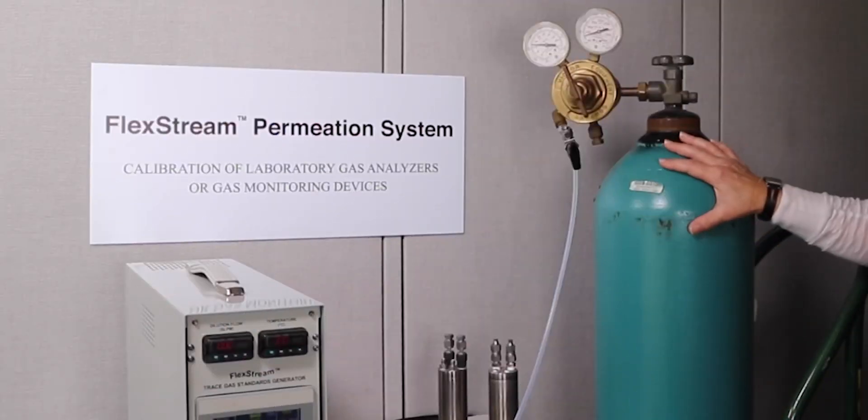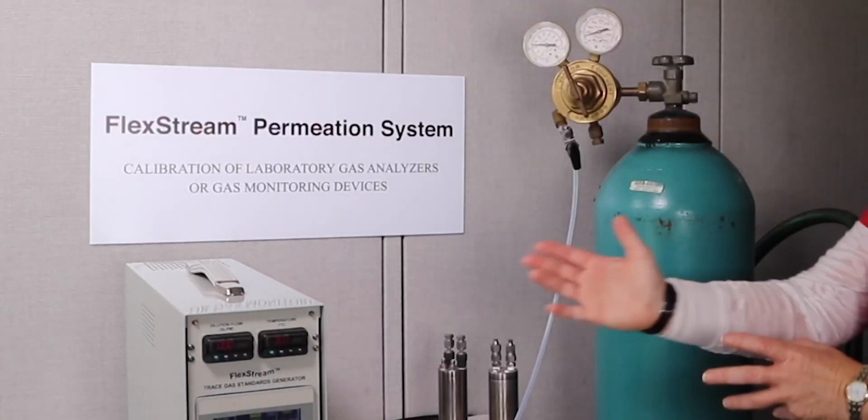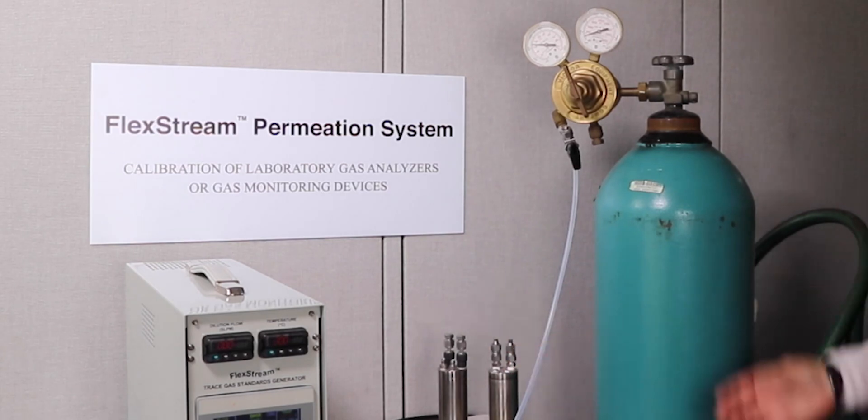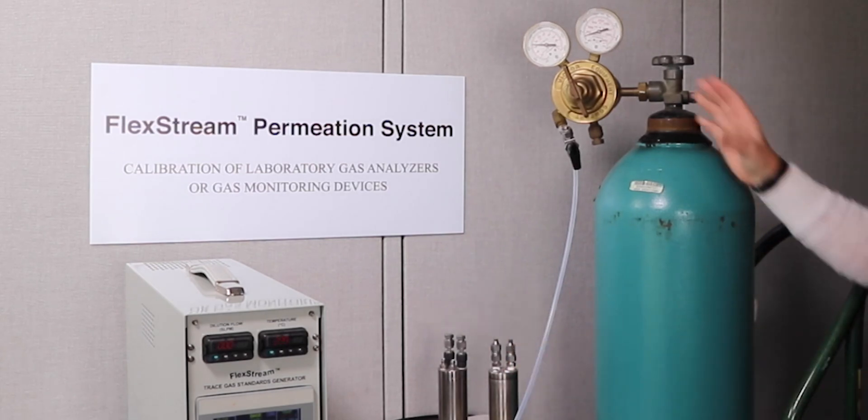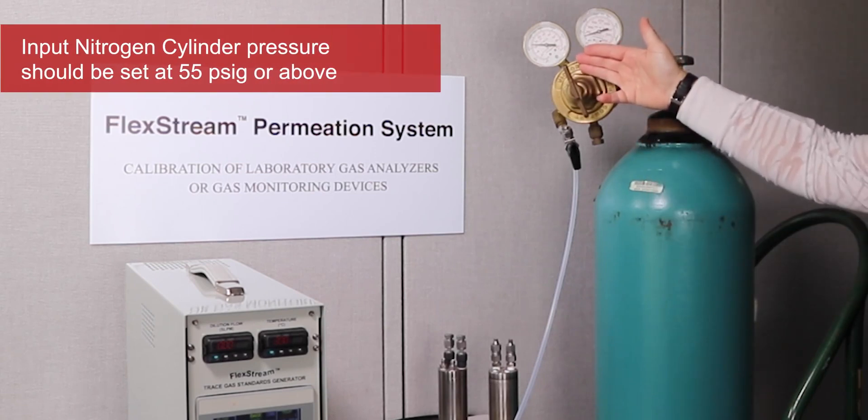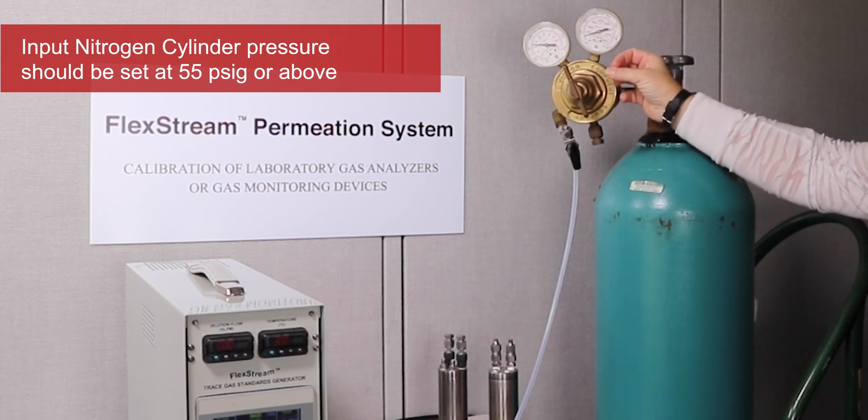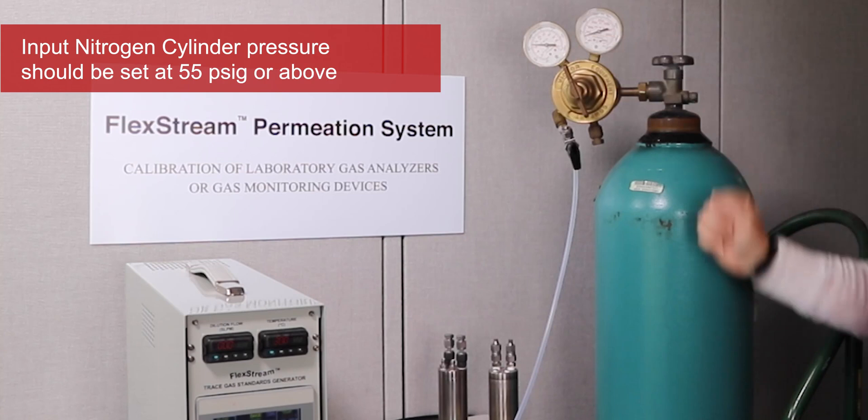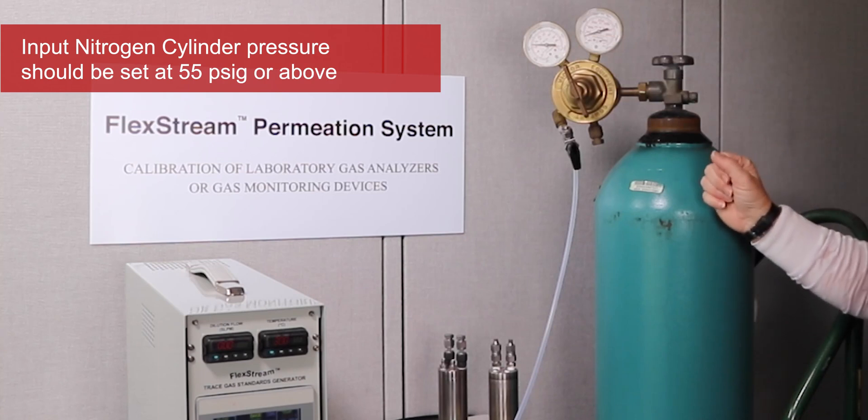Today we're going to be using a nitrogen cylinder to connect to our FlexStream base module. When you're using a cylinder gas, you want to make sure that your regulator is set to a certain pressure. We're setting it above 60 psi, but 60 psi and above is fine. You need to be above 55 psi. So our cylinder here is set to about 60 or 65 psi.